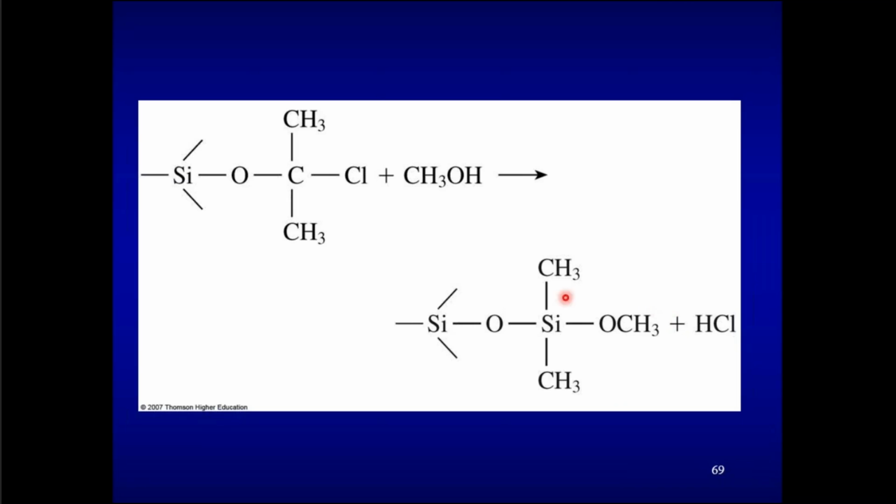So like this, you can be reacting with various other liquids in order to change the polarity of the terminal group, where the attachment is going to take place. So as you make it more and more non-polar, you can have non-polar liquids getting attached or covalently bonding to this silica surface.